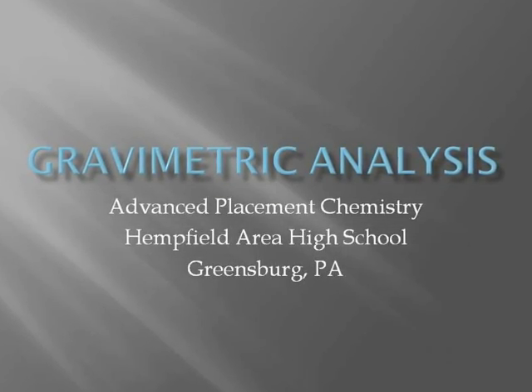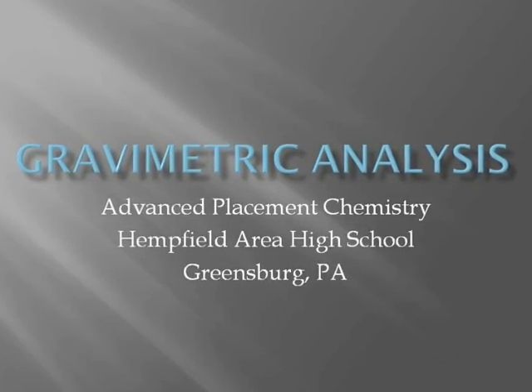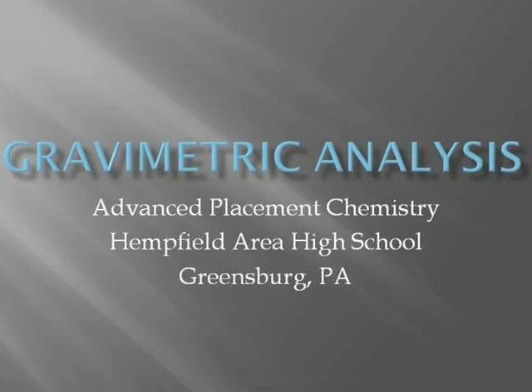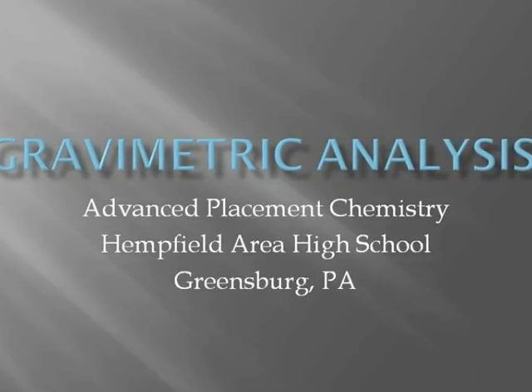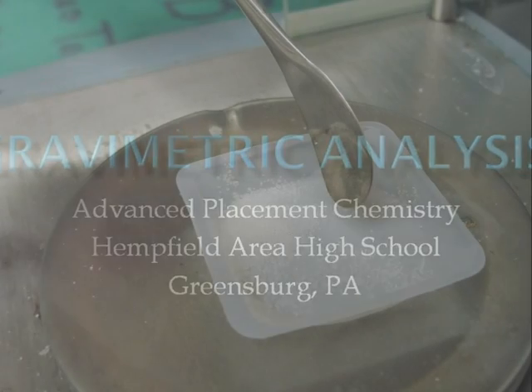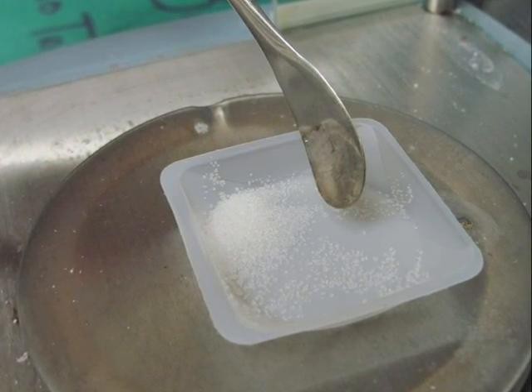This is an overview of the Gravimetric Analysis Laboratory for Advanced Placement Chemistry at Hempfield Area High School in Greensburg, Pennsylvania. Obtain an unknown chloride salt sample.